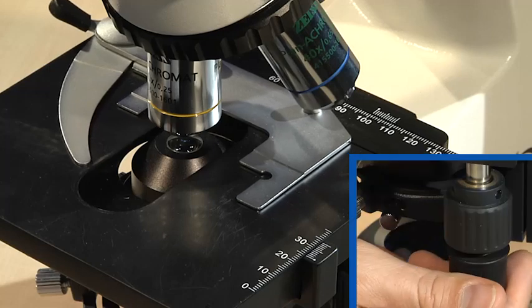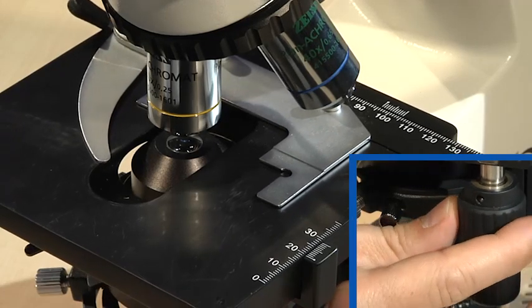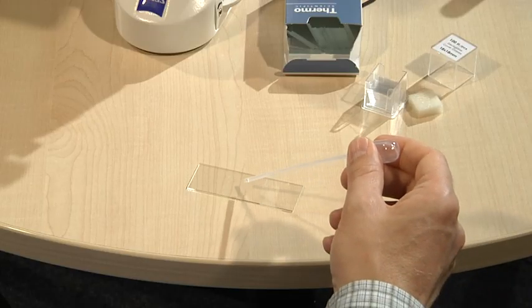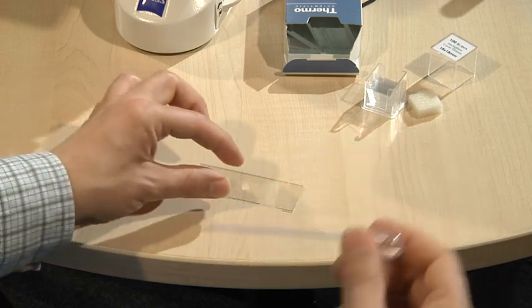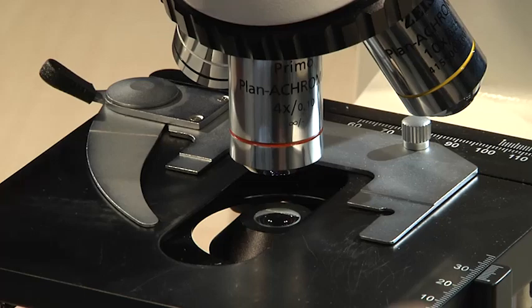The specimen stage is equipped with control knobs for moving the slide in X-Y directions. Here, the specimen, mounted onto a glass slide, is placed for observation.